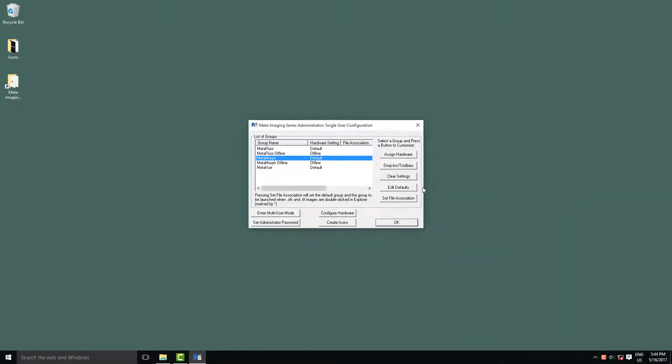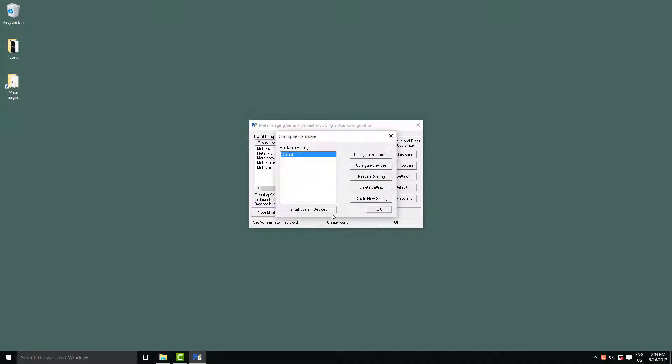We're going to be configuring regular Metamorph, so we choose configure hardware. There are two main options here. The first one is install system devices, and this is what you want to select to set up the rest of your microscope, but for our cameras we want configure acquisition.